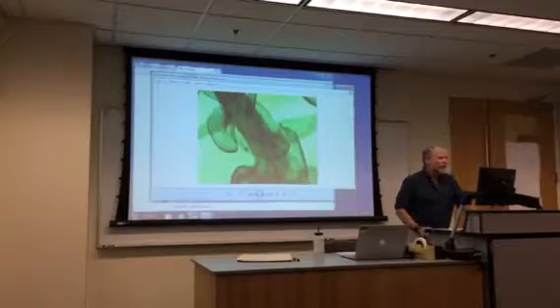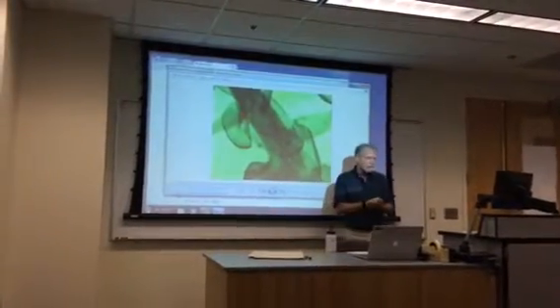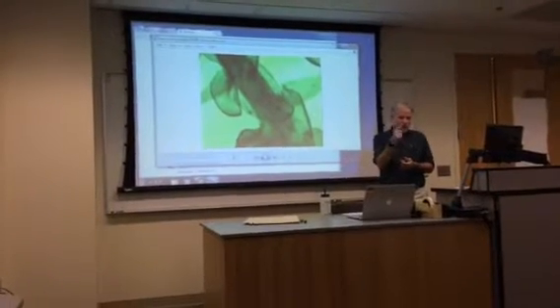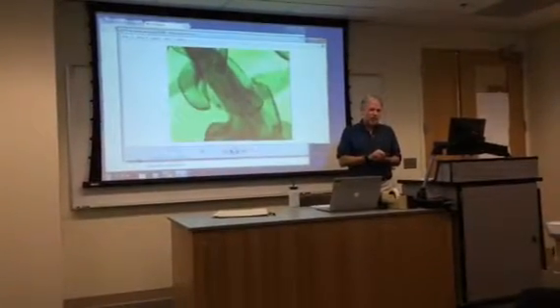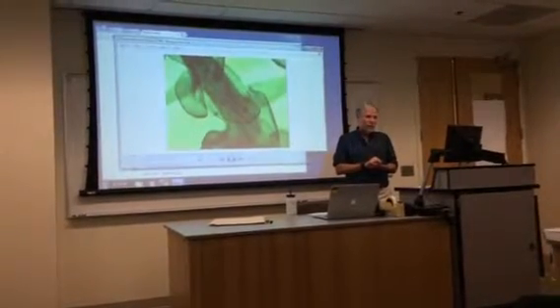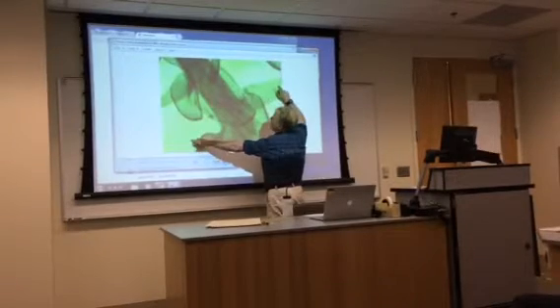Okay, the other thing, you have to know these guys vegetatively. So how do we tell the leafy liverworts from the mosses? The mosses have spirally arranged leaves, sticking out in all directions from the stem. They almost always have a midrib as well. Leafy liverworts never have a midrib, and the leaves are sticking out in 2 directions.